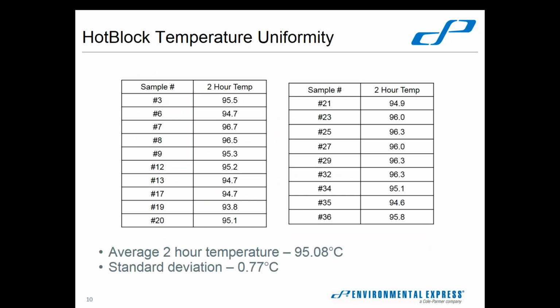We've got one, this is probably a decade at least old, that we put together. And this is just spots that kind of map out edges and middle and corners of one of our 36 well hot blocks, just to document some of the temperature across that block. And I debated actually putting those tenths of a degree on there, but I figured why not.